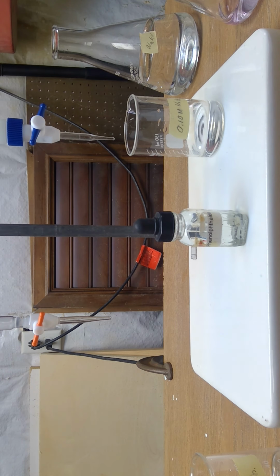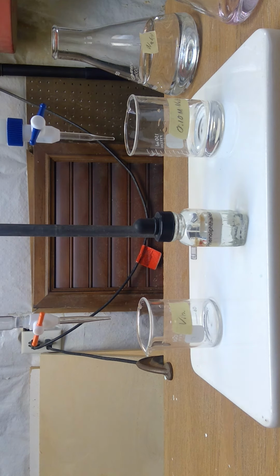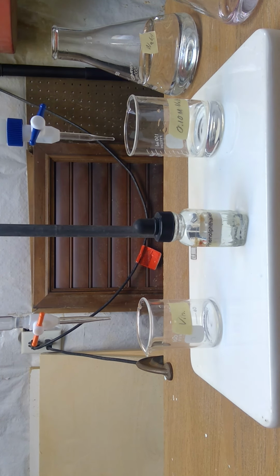So let's get our ending points here. So now we added exactly 2 milliliters of the acid. So our ending point of our vinegar is 32.00. And the ending point for our NaOH looks like about 20.41. 20.41 is our final for our NaOH. All right, so there's our trial 1.